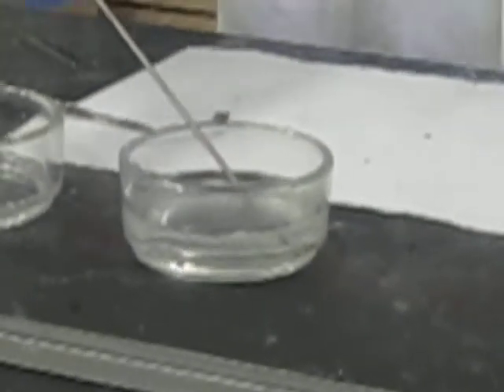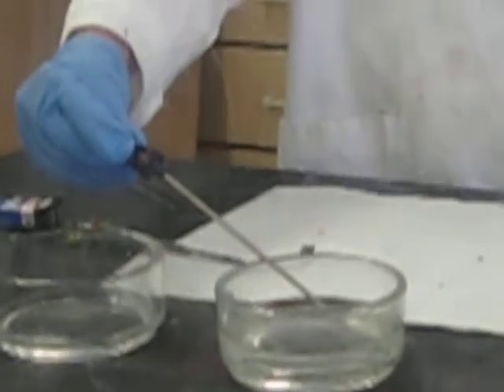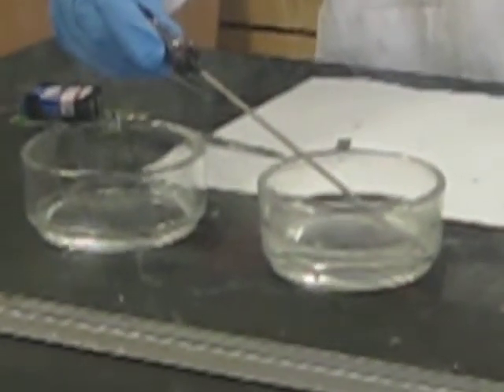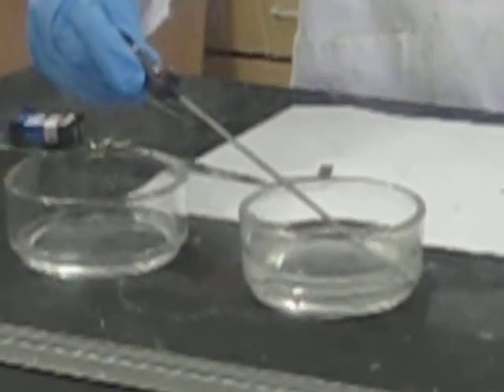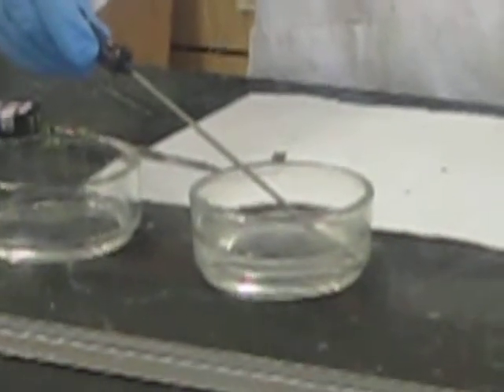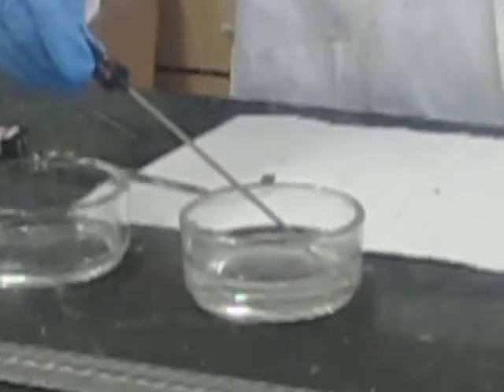So now I'm going to take my lovely thermometer, and I'm going to take the temperature again after the chemical reaction. And it's going up, and we're over 40, and now we're over 42, over 43, over 44, over 45. 45.3.